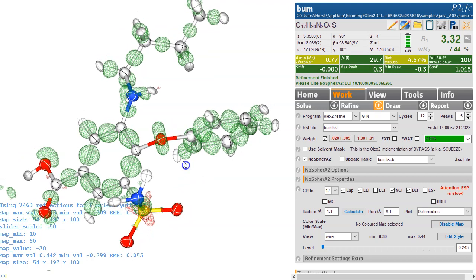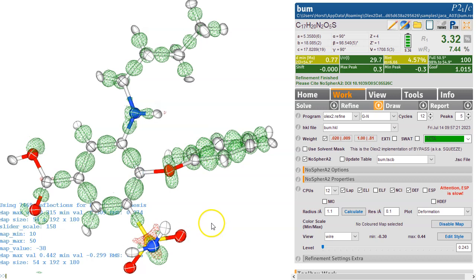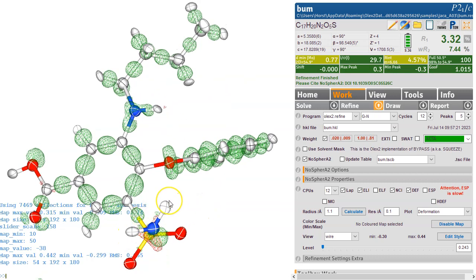So this is a really nice way of doing this. This is all live here. So this is just a standard desktop computer, and it can be done even, you know, for a molecule of this nature. And it might give you some more information about your structure that you might not get with just the independent atom model. And also, because now all the hydrogen atoms are refined freely, they're in the real positions, they are where the neutron experiment would find them. They're not restrained or constrained. So these distances and the relative, you know, where they are, the position of the atoms is now no longer in question. So we know this for sure. Thanks for using Olex2.